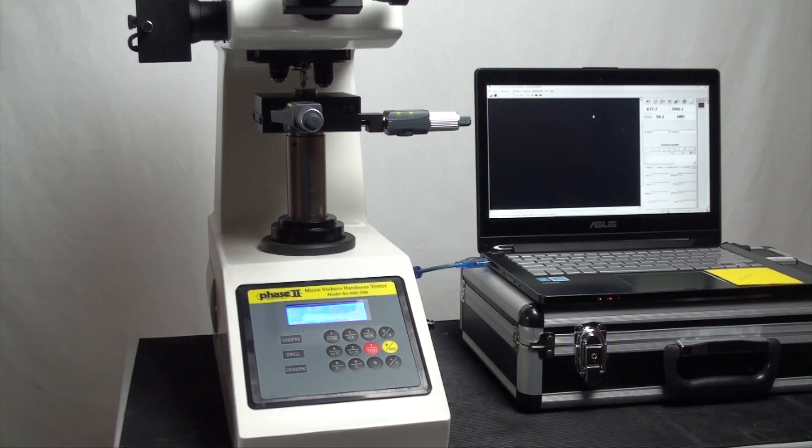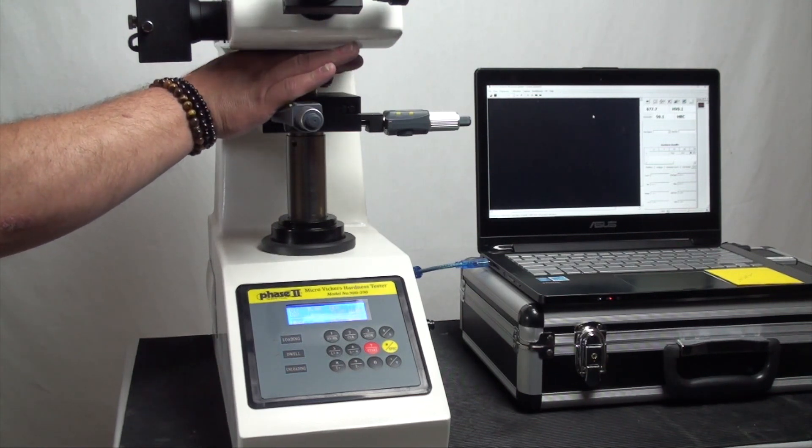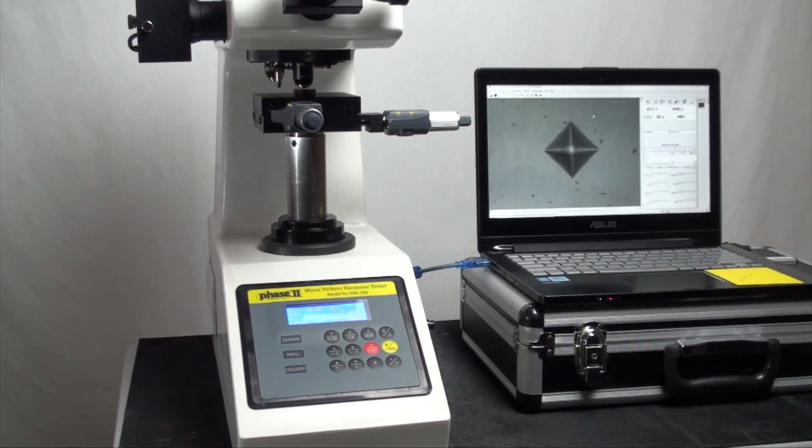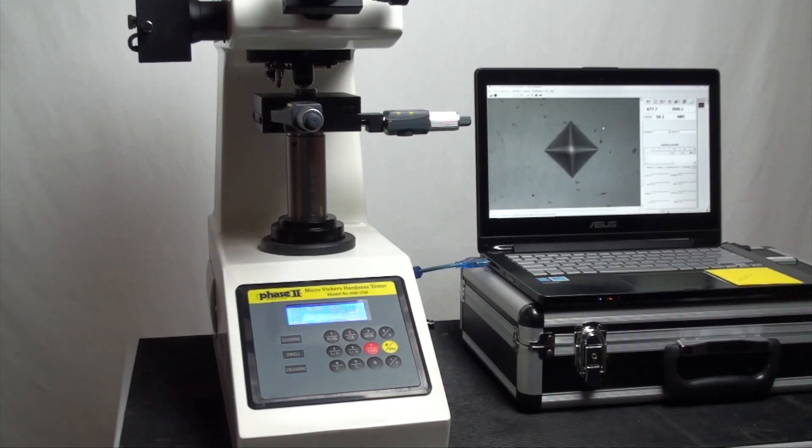Upon completion, manually change the turret back to the 40X optics to see the indentation made and begin measurement on the computer screen.